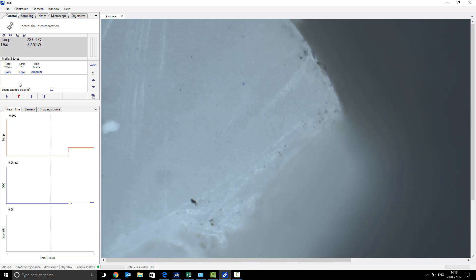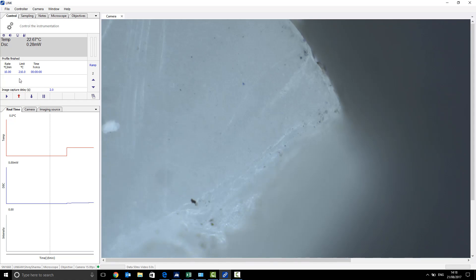And once you've got your parameters set up for the rate, limit, hold time and the image capture delay, you're ready to do your run. All you need to do now is press the play button here and await your DSC results. Thank you.